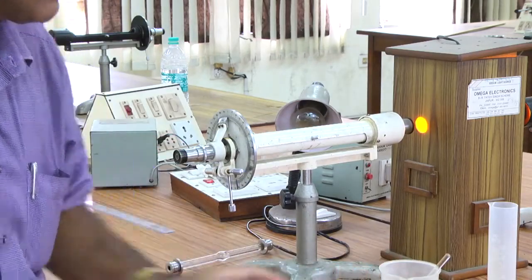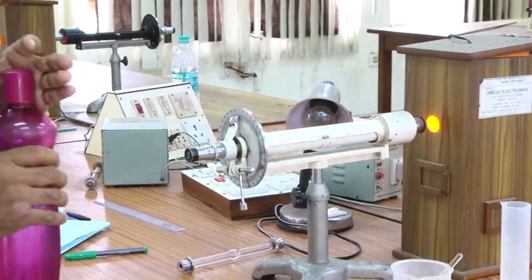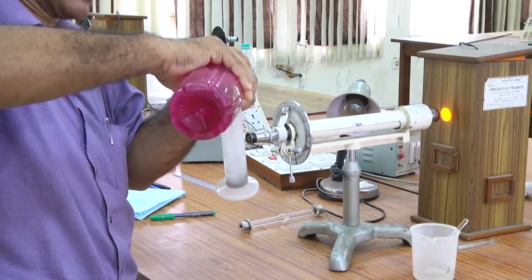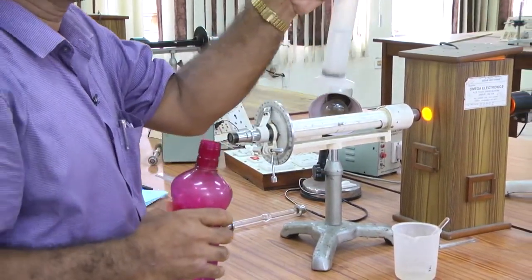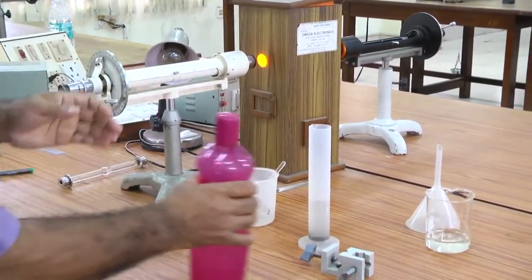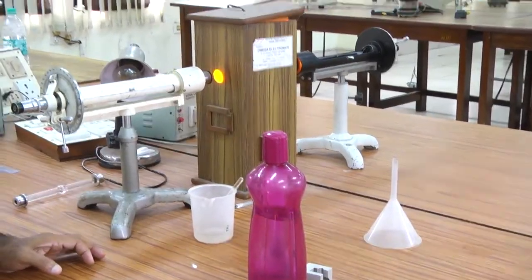Now, you take out this solution and prepare the next one. If you have more solutions, here I have more solutions, okay. So, I will put in distilled water. I have to calculate what percentage I want. So, after calculation I will make it, okay. I add water into the solution.